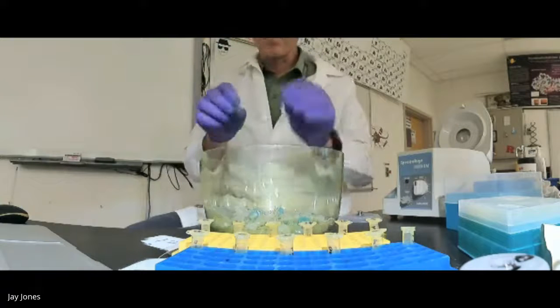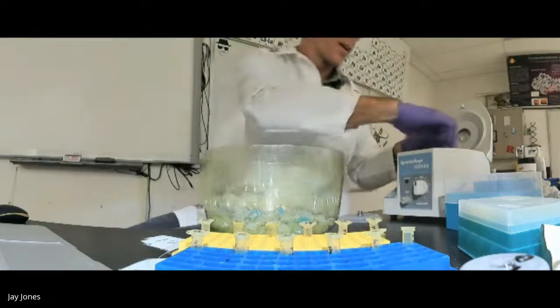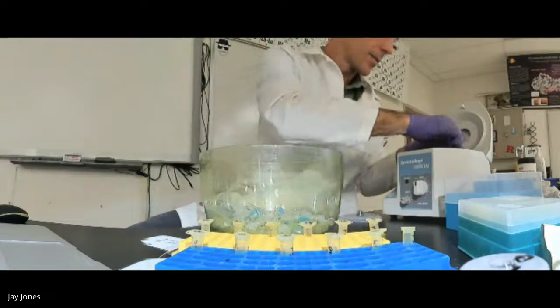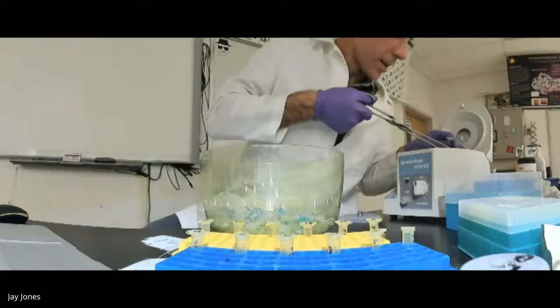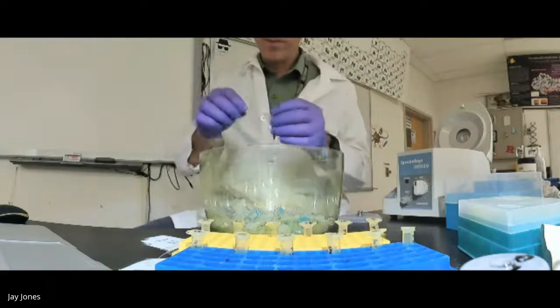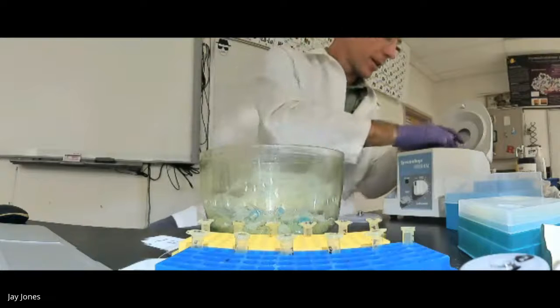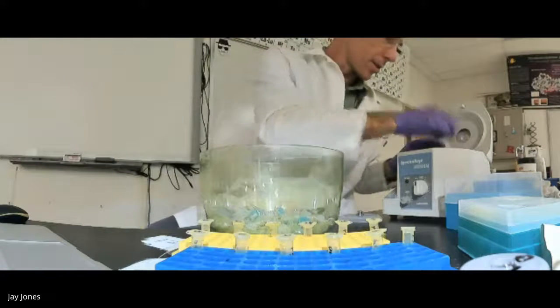But see, the column, I could be really not careful with, because the column is holding the plasmid DNA and it's not going anywhere. That plasmid DNA is stuck to the column. Every time I pull it out, the column comes out, but the collection tube stays in. It doesn't want to leave. It loves its home. Okay. Good, and I checked that one. All right, so that's all of them.